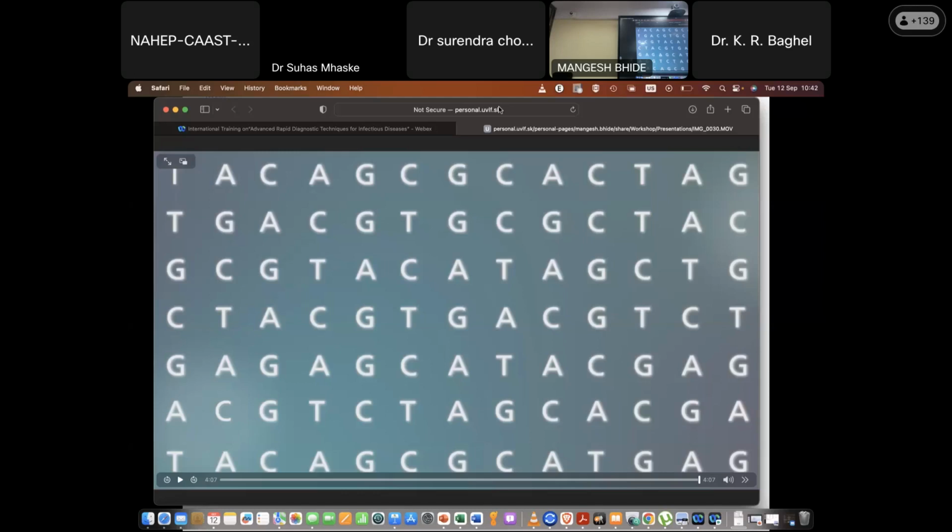If you want to have a confirmed sequence of any gene or any PCR product, you have to sequence from both. I prefer the reverse primer if I want to see what it is. More than 60-70% of the time I get good results with the reverse primer rather than the forward. I don't know why, but for me reverse is lucky.